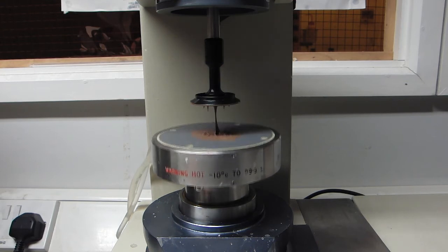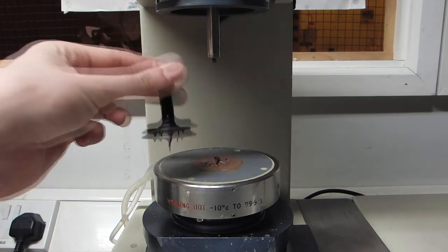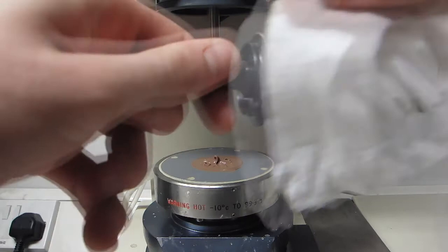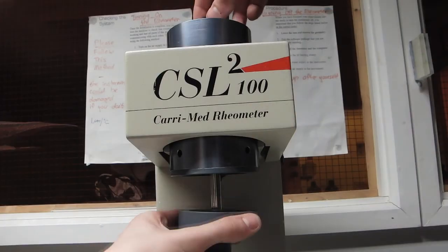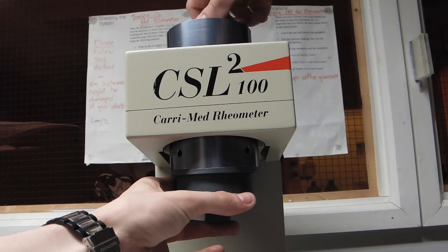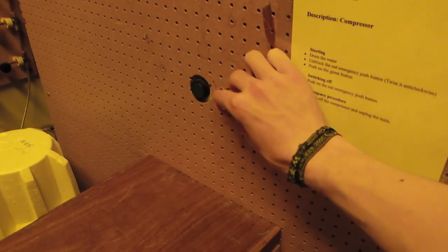When the procedure is complete, we lower the ram and remove the geometry. Both the geometry and the plate are then cleaned. We then replace the air bearing clamp, turn off the water supply, and turn off the air compressor.